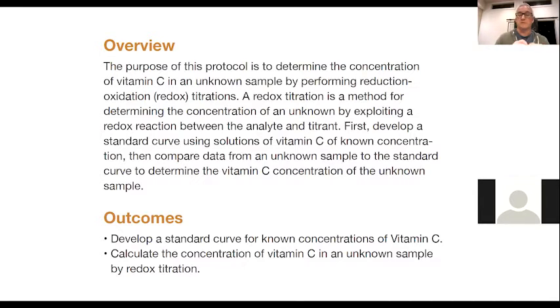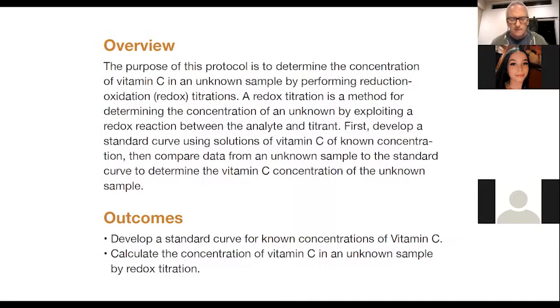So it says we are going to be doing a titration. What's a titration? What does that mean? Is it something with like finding the concentration? Right, it's a technique to determine an unknown concentration.